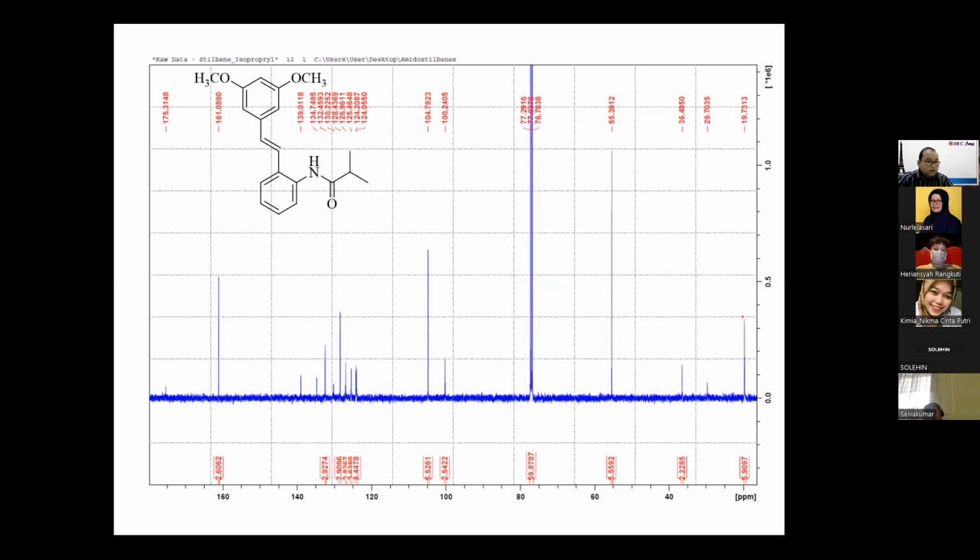So we put number 1, number 2, number 3. All peaks that you see sometimes contain impurities. What you can do is just number all the peaks that you see, and after that we will look again at whether each peak is an impurity or your signal. So you put number 1, number 2, number 3, this one number 4.